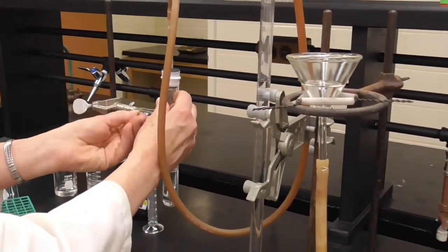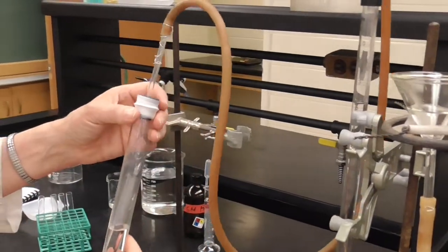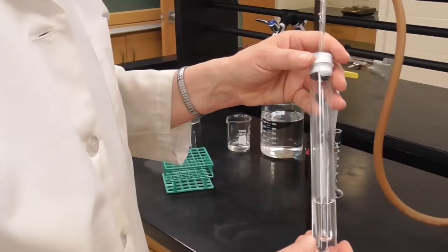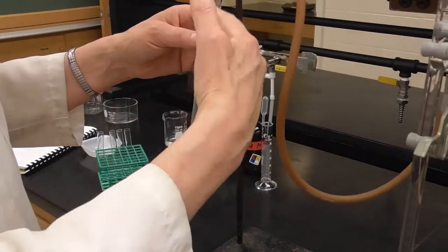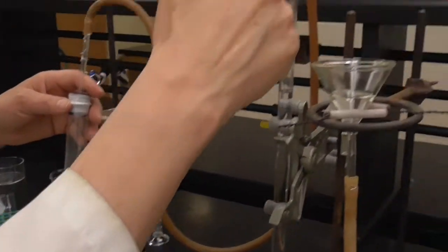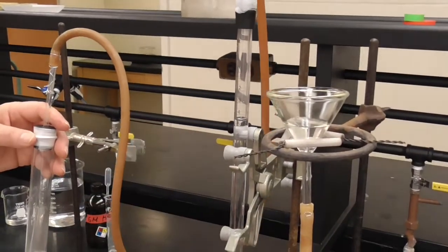This is a reaction between the aluminum in the pieces of pop can and the hydrochloric acid, and that reaction will generate hydrogen gas, which will then bubble up and flow through the tubing into the burette and push the level of water in the burette down.